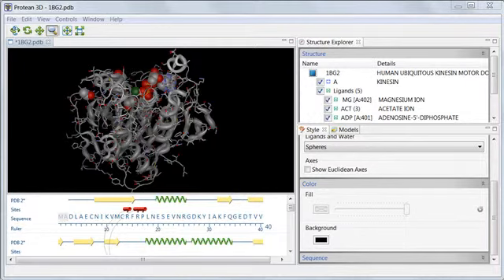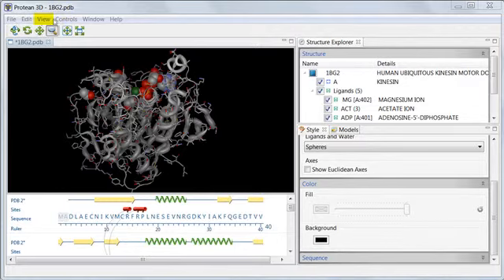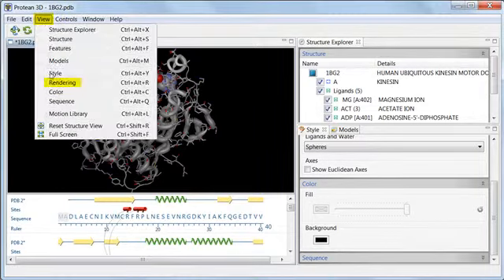First, I'll open the rendering bar, which is located in the Style panel. If the rendering bar isn't visible, I can open it by going to the View menu and choosing Rendering.